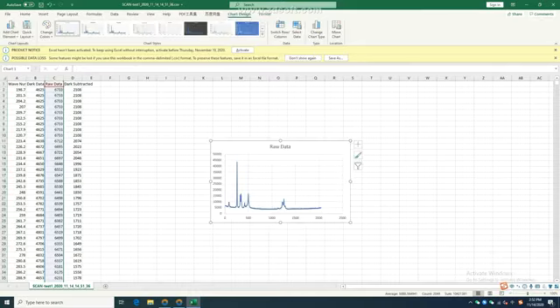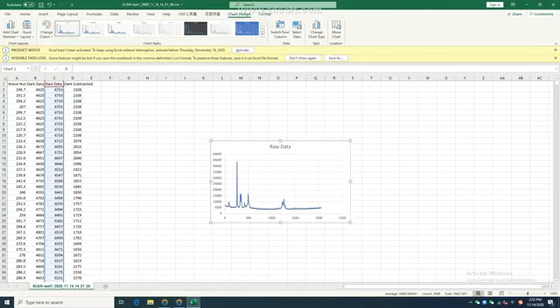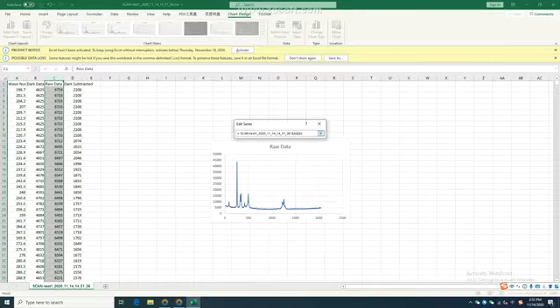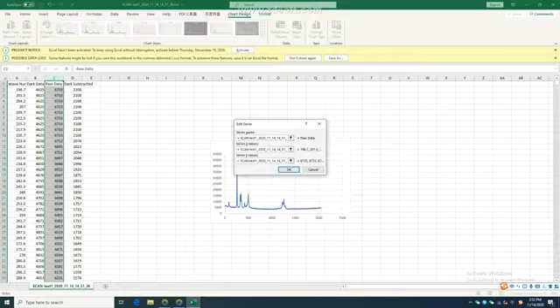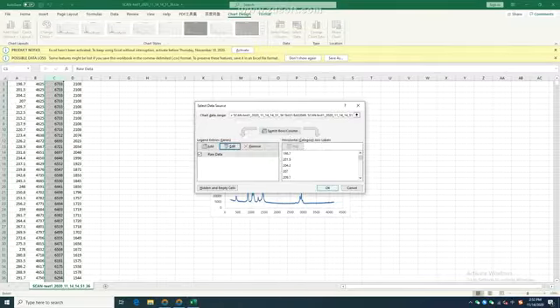This is the scan test graph database in Excel. And then you can open the paracetamol, and you can export the paracetamol TXT file.